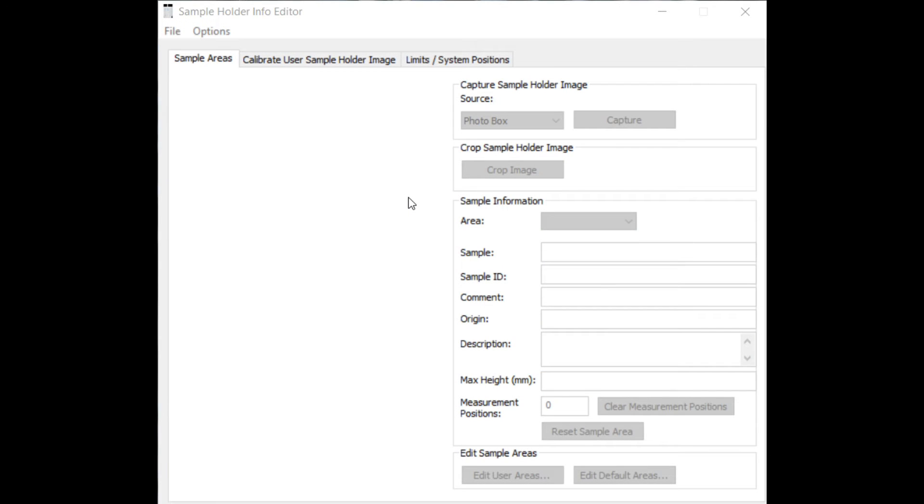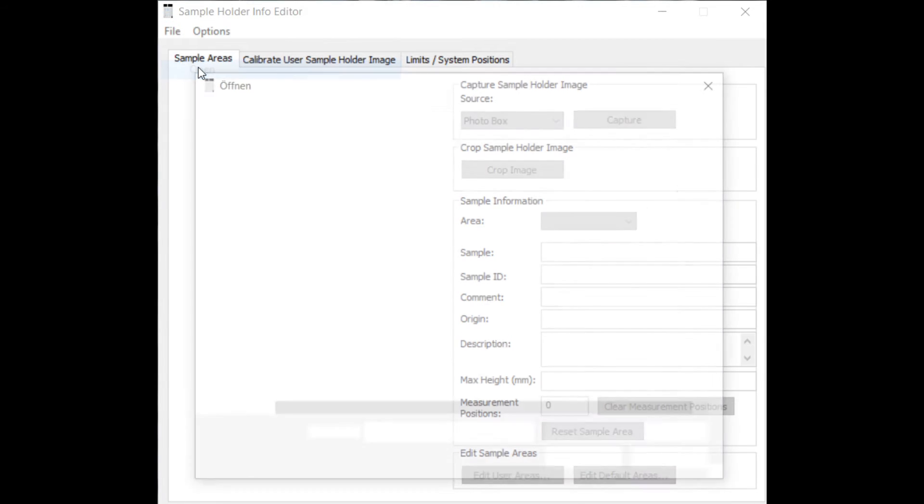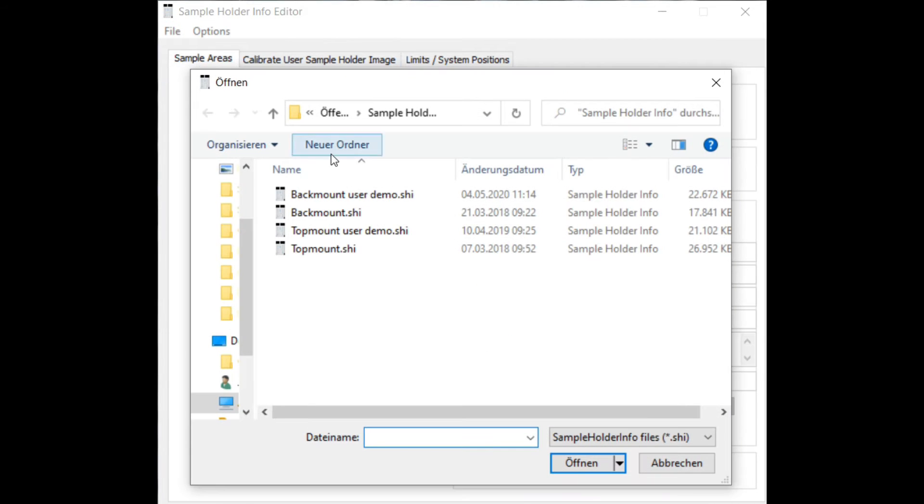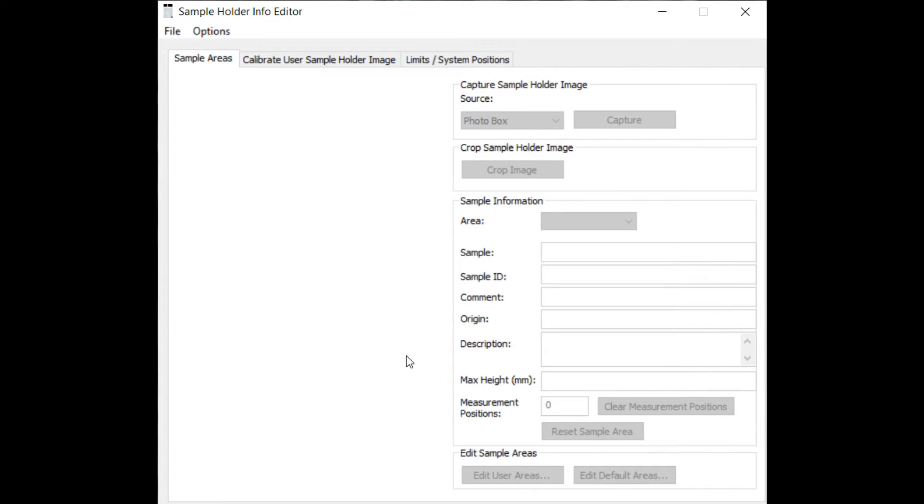After you have mounted your samples on the sample holder, open the app Prepare Sample Holder, which is installed together with SurfaceLab. Load the sample holder info file which belongs to the used sample holder, for example backmount.shi.